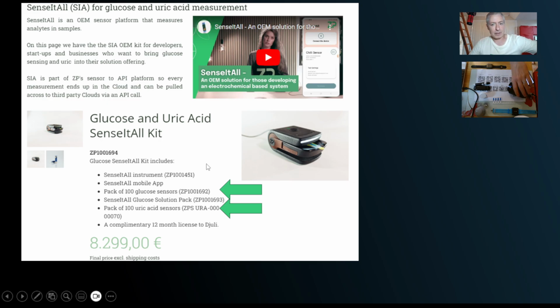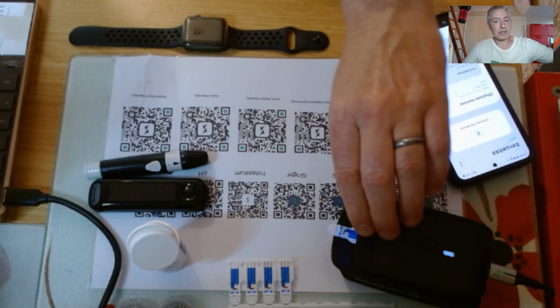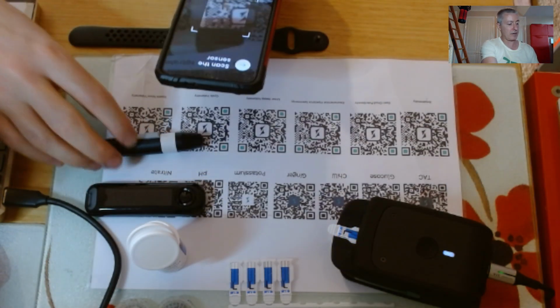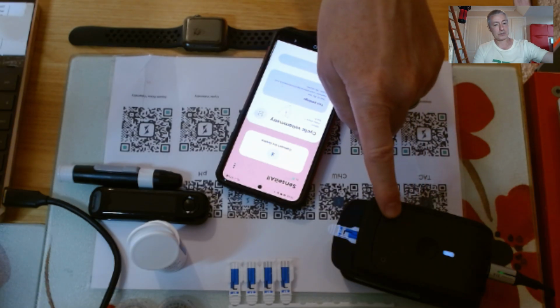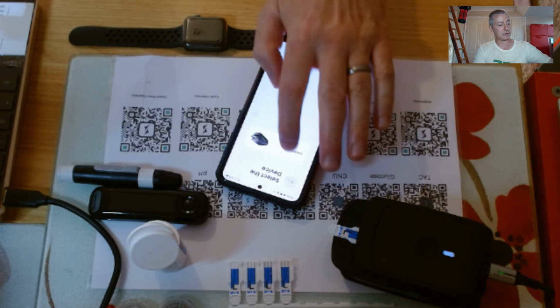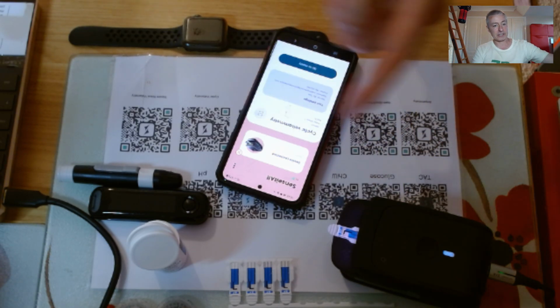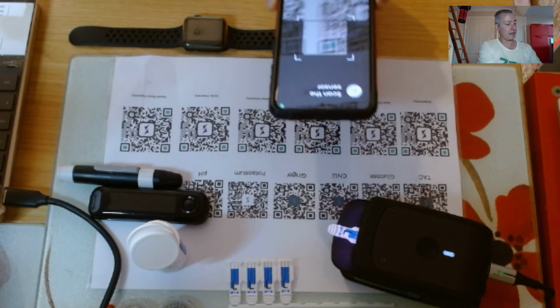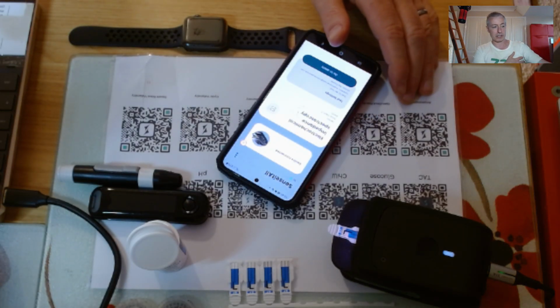In fact, I might just change screens for a second. I'm going to use this potentiostat to actually talk about cyclic voltammetry in a bit. I've just put the app into cyclic voltammetry mode. This potentiostat, I need to connect it. There we are, it's connected now. This is now in Bluetooth connection with this, and that means I can do cyclic voltammetry on this. This will become a little bit more useful and apparent in a short while, also in impedance spectroscopy, because I'm going to talk about impedance spectroscopy in a short while as well.